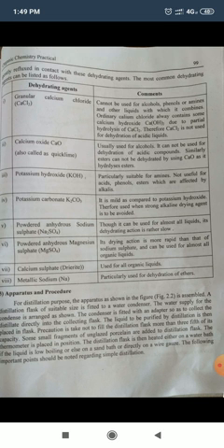Precaution is taken not to fill the distillation flask more than 3/5 of its capacity. Some small fragments of unglazed porcelain are added to the distillation flask. The thermometer is placed in position. The distillation flask is then heated either on a water bath, and if the liquid is low boiling, or on a sand bath or directly on a wire gauze. The following important points should be noted regarding simple distillation.